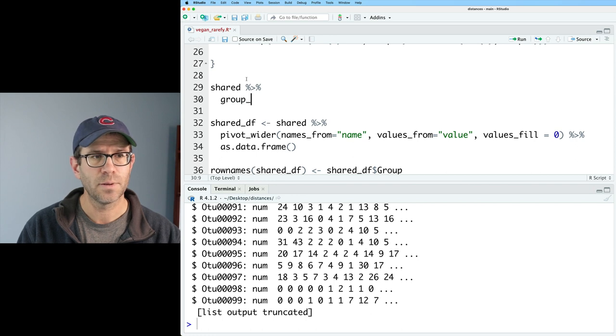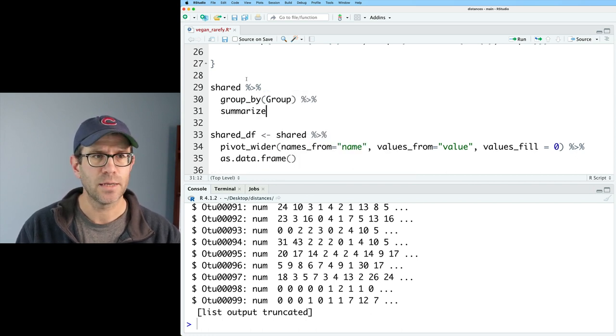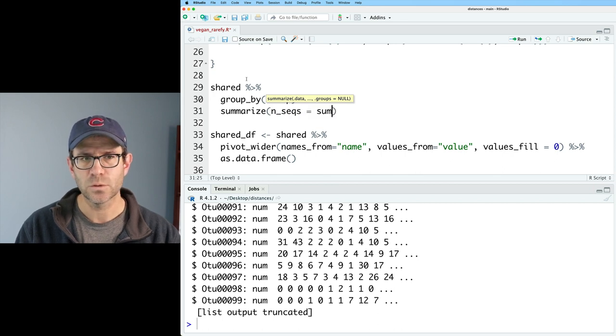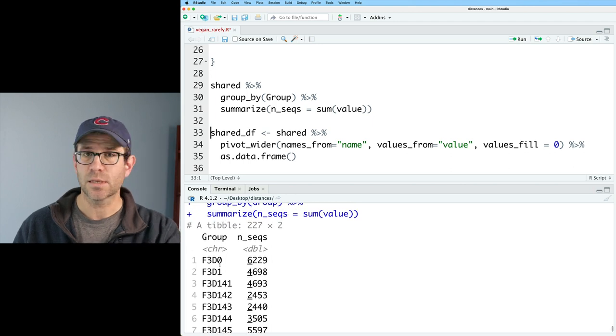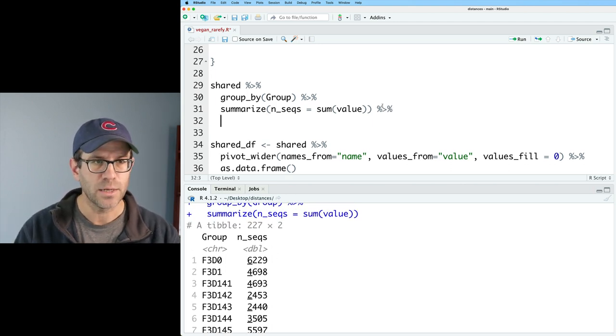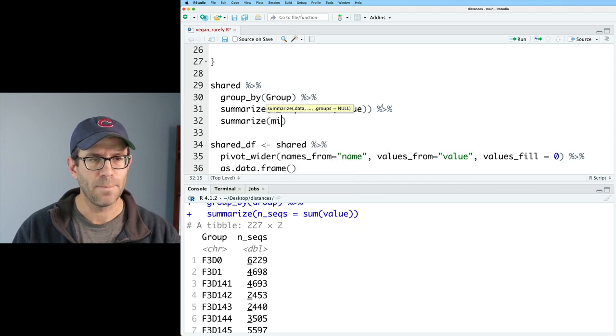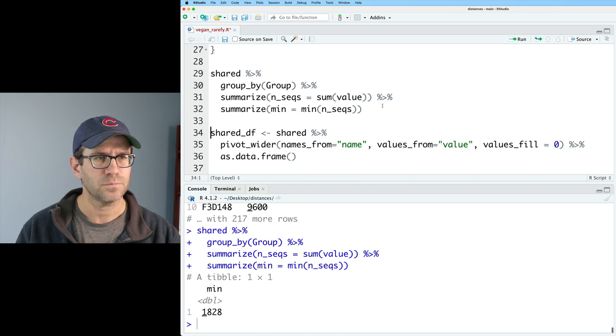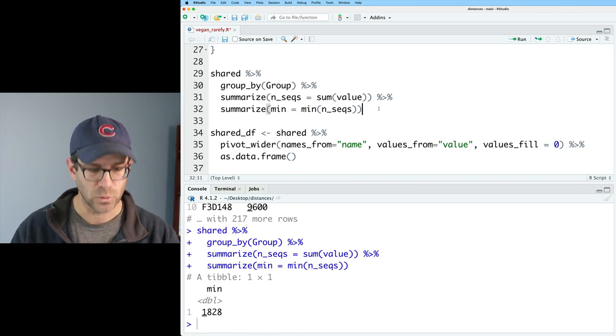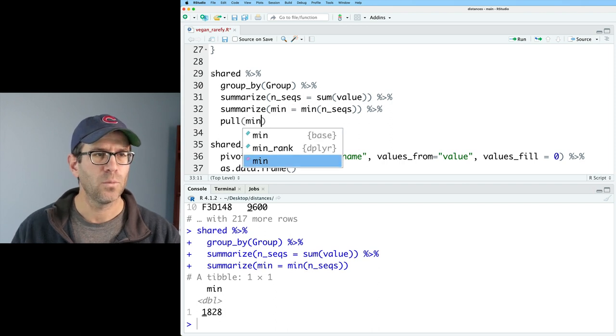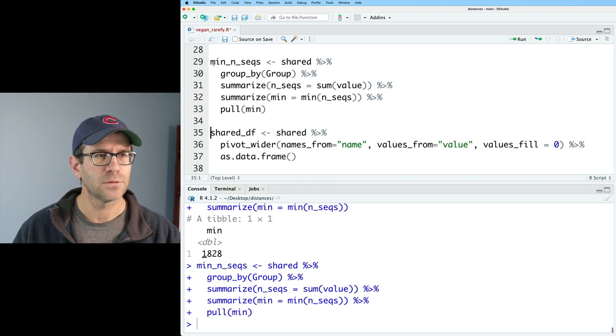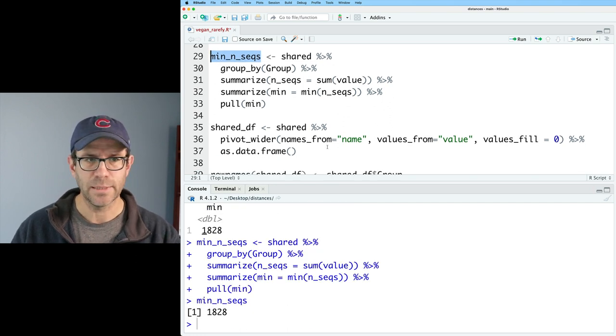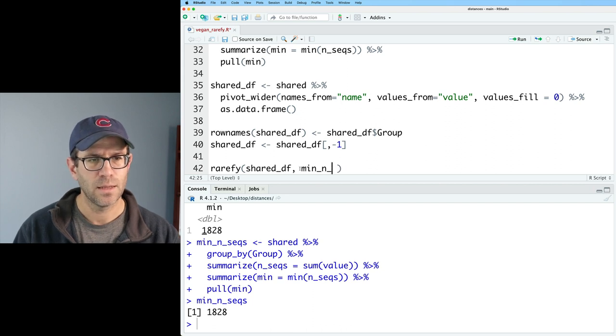And we'll do a group_by group, right? And then we'll do a summarize. And we'll say nseqs equals the sum of value. And so now what we get is a column for our group and nseqs. I'm going to do another summarize on this. And we'll do min equals min on nseqs. And so that gives us 1828. And I'll go ahead and do a pull on min. And we will then assign the output to min_nseqs. And so now if we look at min_nseqs, we get 1828. That's great. And then I can plug that in here, min_nseqs.